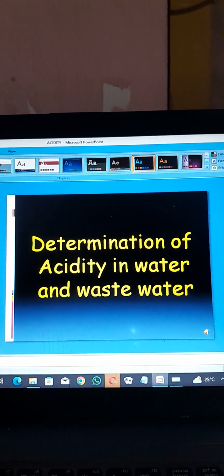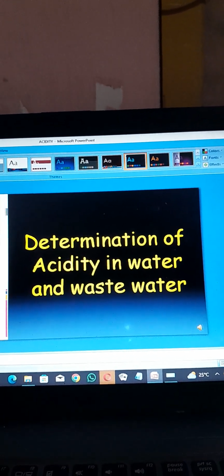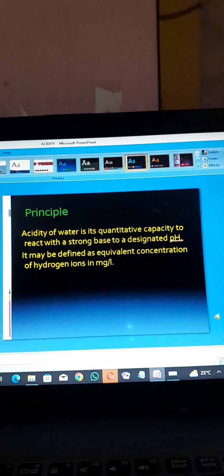Today's topic is determination of acidity in water and wastewater. So let's come to its description. What is acidity? Acidity describes the amount of acid in a substance. An acid is a chemical that gives up hydrogen ion in water, and forms a salt by combining with certain metal.